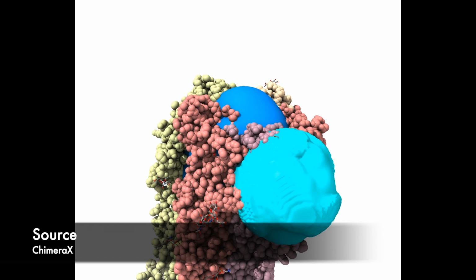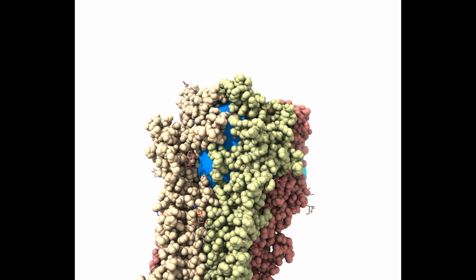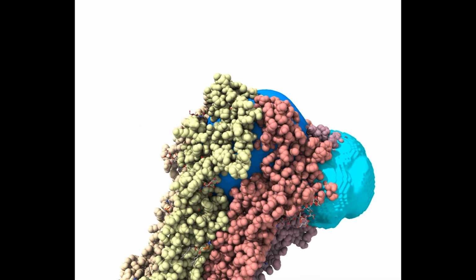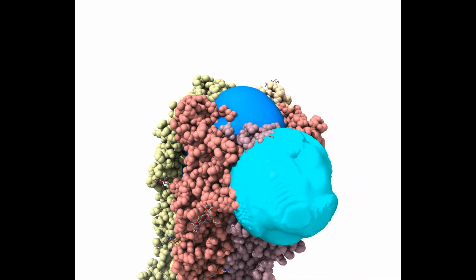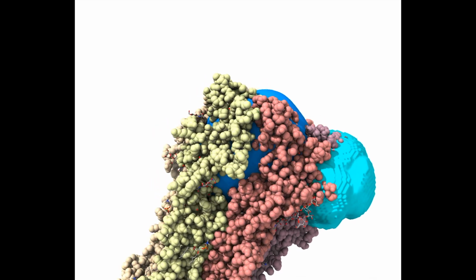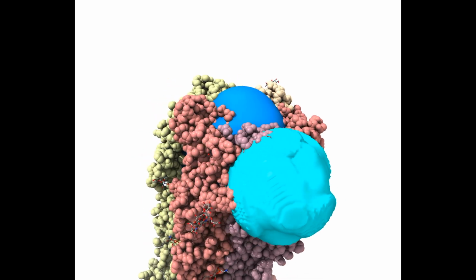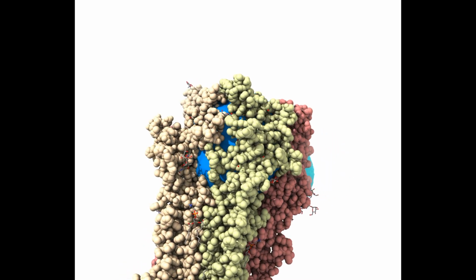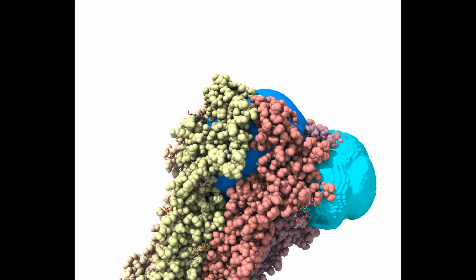And that's what I'm showing here in this video. You can see that as it's spinning around, this cyan, light bluish color is the thing that's covering the gamma site as well as the toxin there. And then you have this deeper blue, which is basically just filling the inside of the pore there. These are specifying the regions for a 3D classification where we want to look at very specific differences and get a better reconstruction, but only in that area.